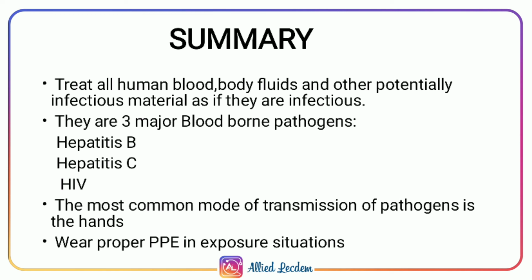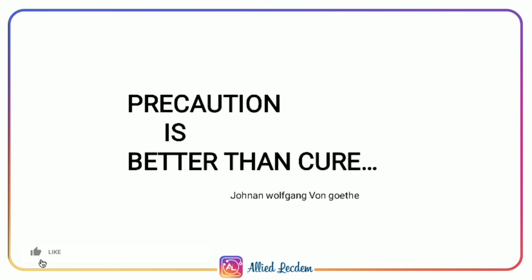Wear proper personal protective equipment in exposure situations. Precaution is better than cure.